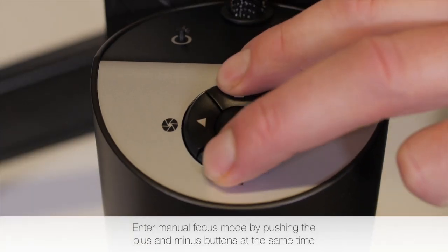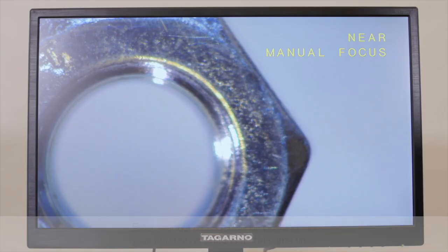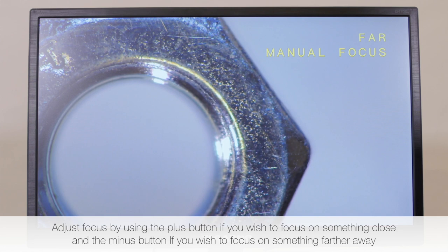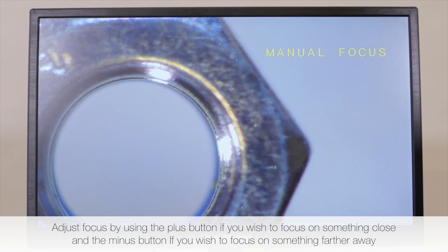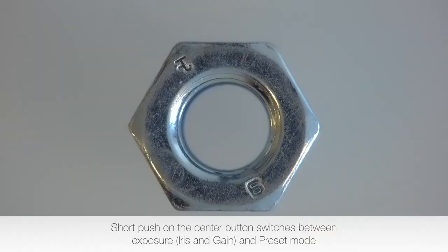Enter manual focus mode by pushing the plus and minus buttons at the same time. Adjust focus by using the plus button if you wish to focus on something close and the minus button if you wish to focus on something further away. A short push on the center button switches between exposure, iris and gain, and preset mode.